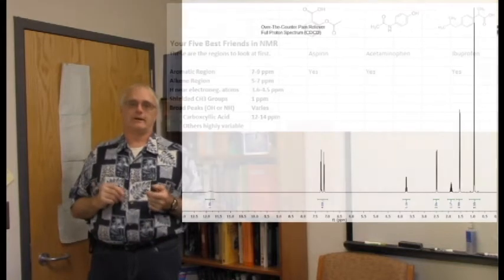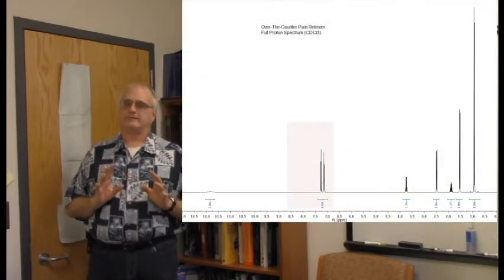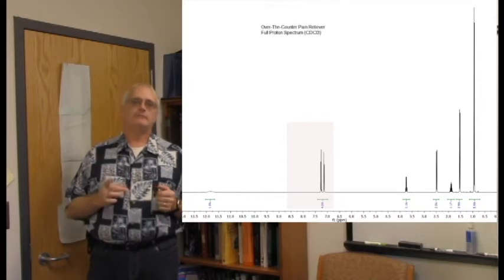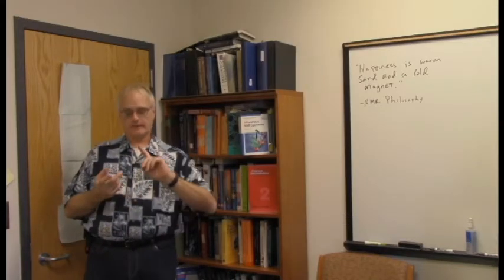And sure enough, our proton spectrum shows that. That's very nice, but that by itself doesn't tell us which one of the molecules. All 3 of the molecules would have something similar. So that one doesn't allow us to tell the difference yet. But on to the next.